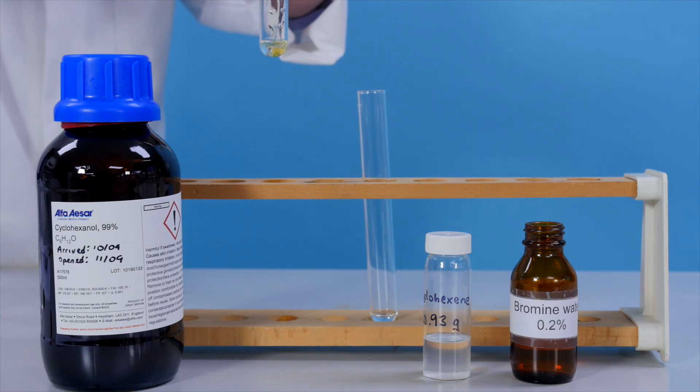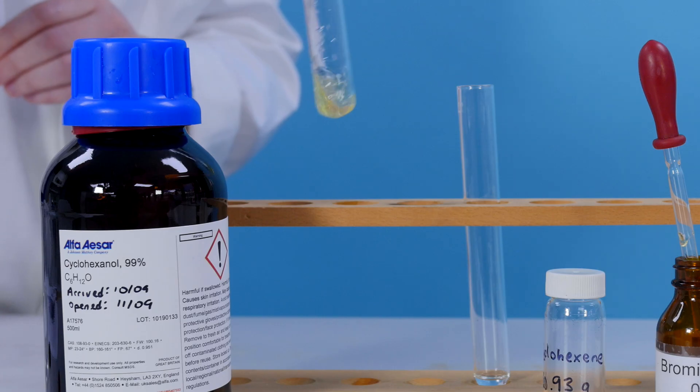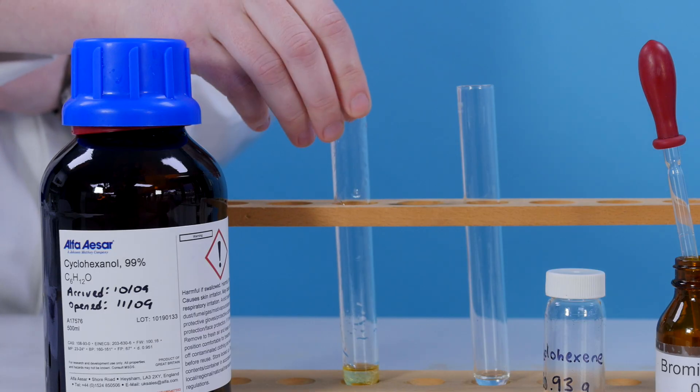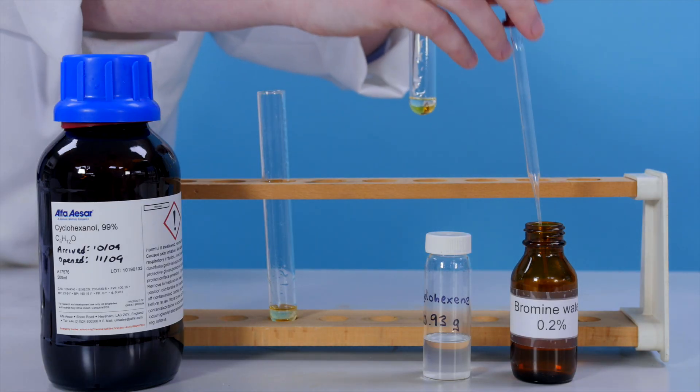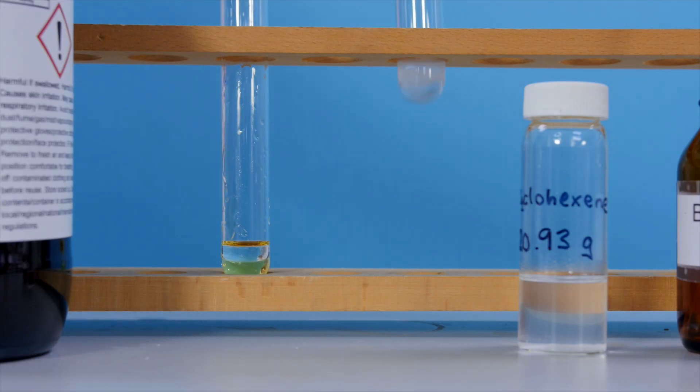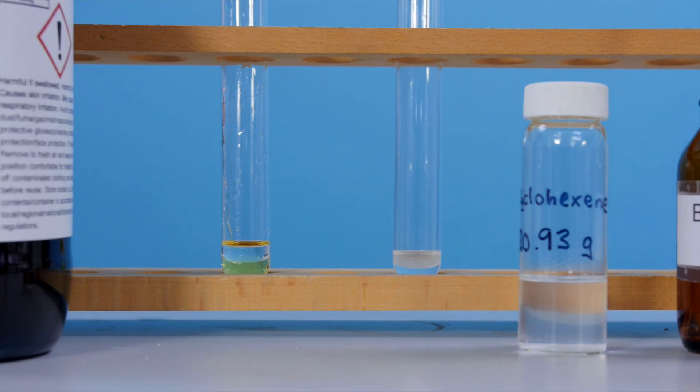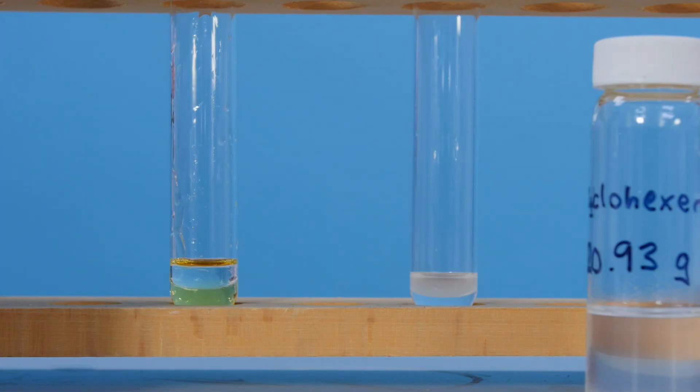We could use chemical tests to check the identity of a product. Here, for example, we can use bromine water to compare the hydrocarbon product to the alcohol used as the starting material. To do this, add a few drops of bromine water to test tubes containing small amounts of the two compounds. Then shake. The bromine water is decolourised in the test tube containing the product, whereas there is no colour change in the tube with cyclohexanol. The alcohol has therefore been converted to a cycloalkene.